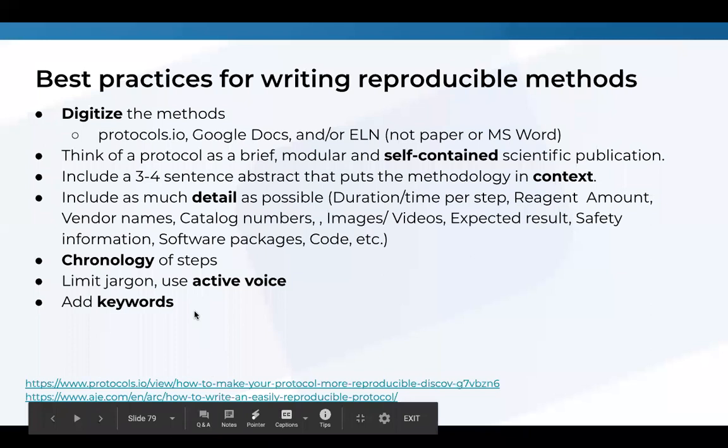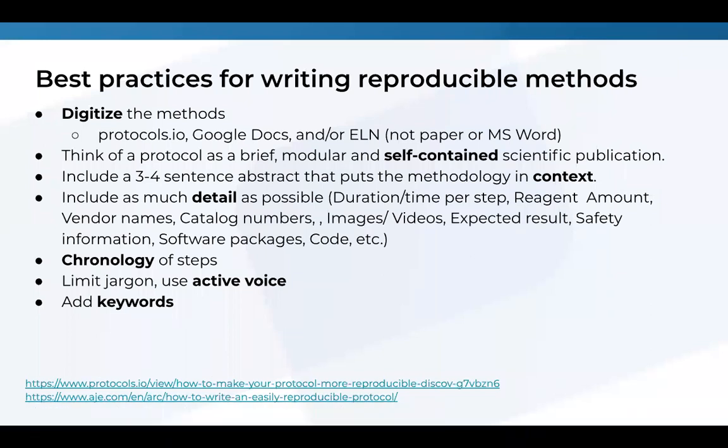And then when you're publishing a protocol, this is more for making your protocol discoverable on protocols.io: add keywords, because the keywords are what people are searching for when they're looking for protocols. So add all the keywords that describe your method. And then also, please add any additional notes, recipes, tips, and tricks. Anything that might seem obvious to you and you think, oh, this is too much information, I think it's a good idea to put it as an additional note for others.